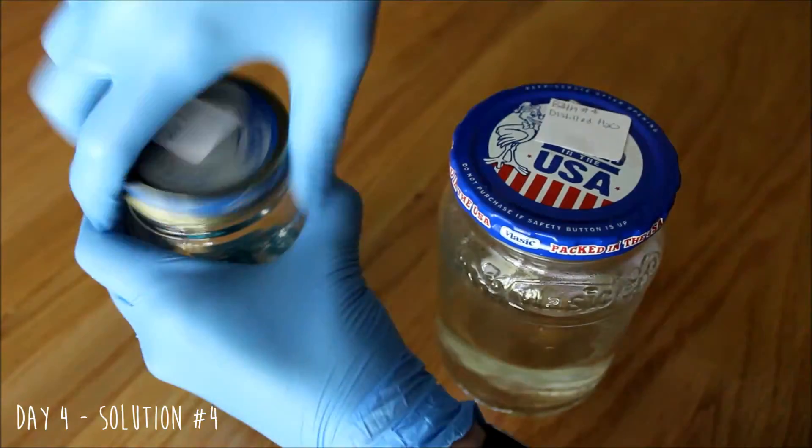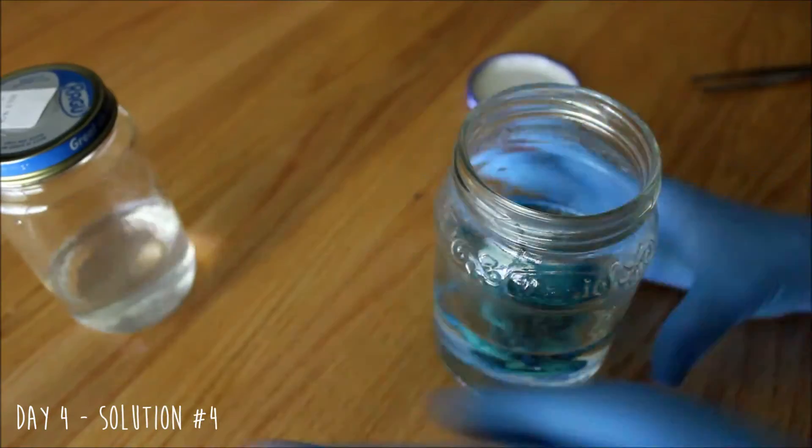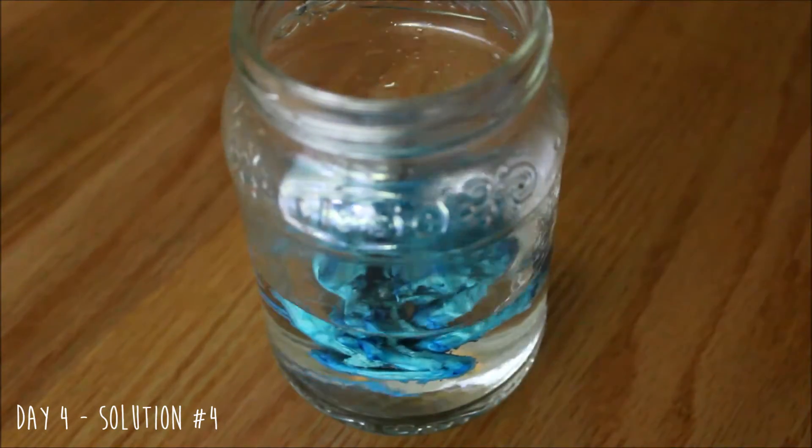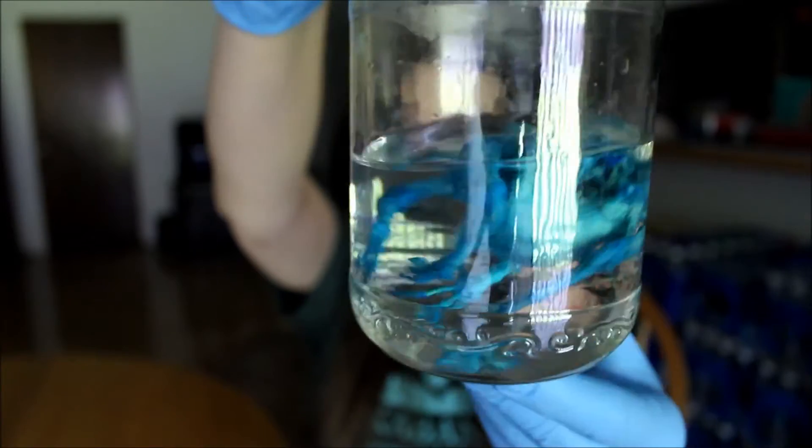Day four: I'm just going to be transferring my bird from bath number three into bath number four which contains just distilled water. This is going to help remove some of the excess ethyl alcohol from the bird. Here's my bird in the distilled water — it's a little bit floaty as you guys can see. I'm not really too sure as to why in the rehydration step the specimens end up floating when they get to the distilled water, so that's kind of a little kooky.